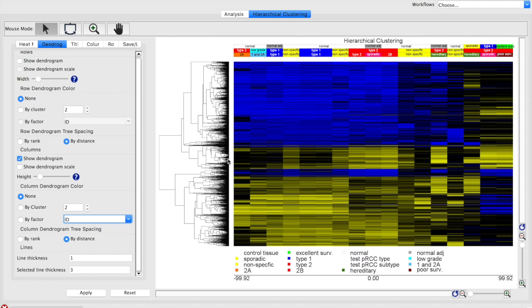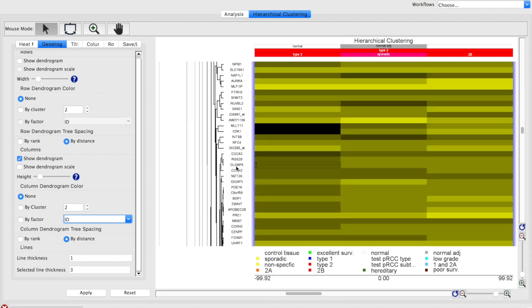So in order to select this cluster, what I'm going to do is just draw a box and select it there. If we want to get a closer look at some of these genes we selected, we just scroll in here. If we scroll in far enough, we can actually see the gene symbols for those particular genes, one of those being Aurora kinase A. I see that a lot, and it's upregulated in a lot of other different types of really nasty cancers.